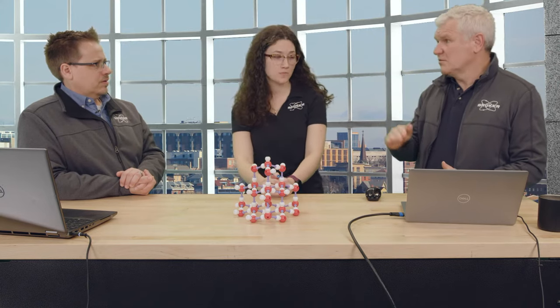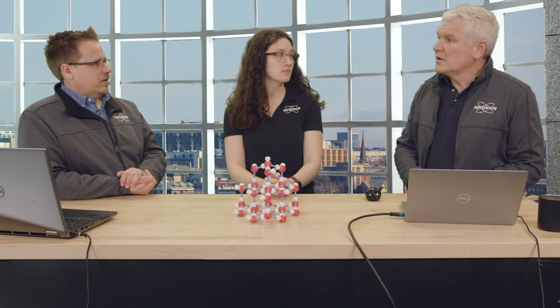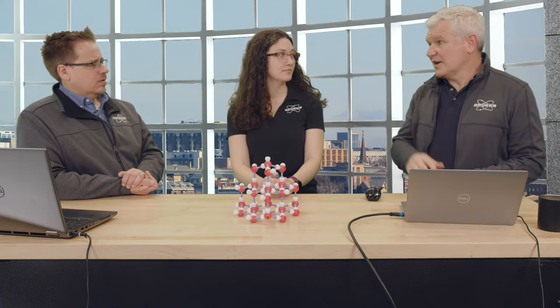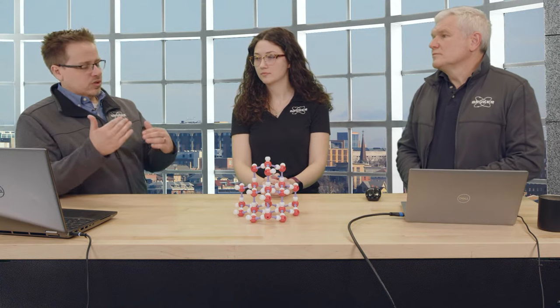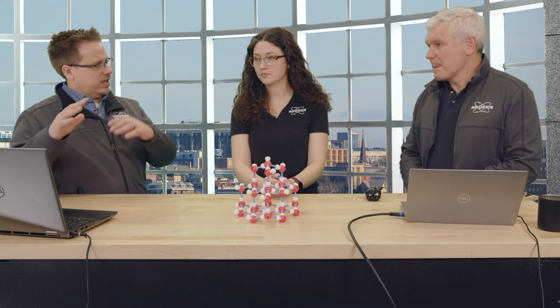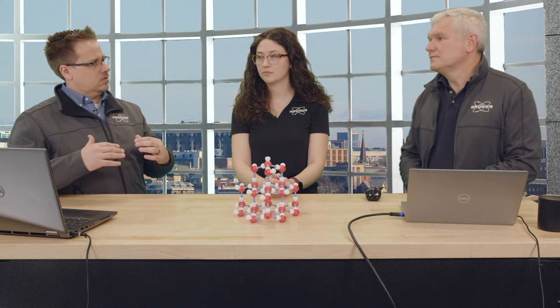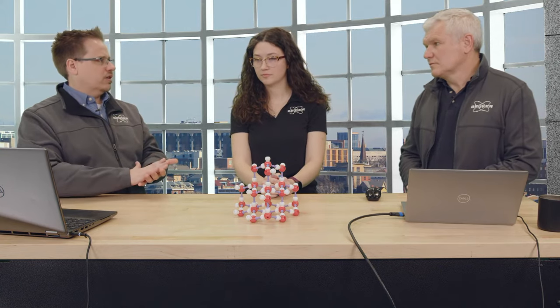When it turns modulated or incommensurate, sometimes it helps to raise the temperature, which is counterintuitive. The first data set I collected on this was at room temperature, so it's also modulated at room temperature. If you want to reduce the modulation effect, collect at elevated temperature or at room temperature. If you want to enhance it, really bring out that modulation, cool it down.